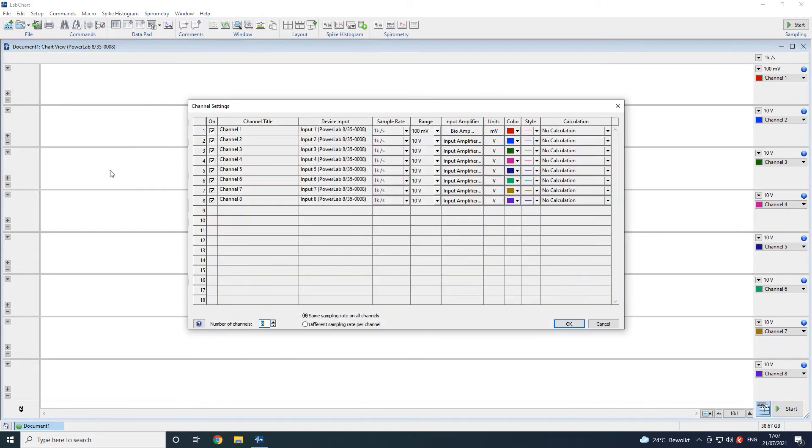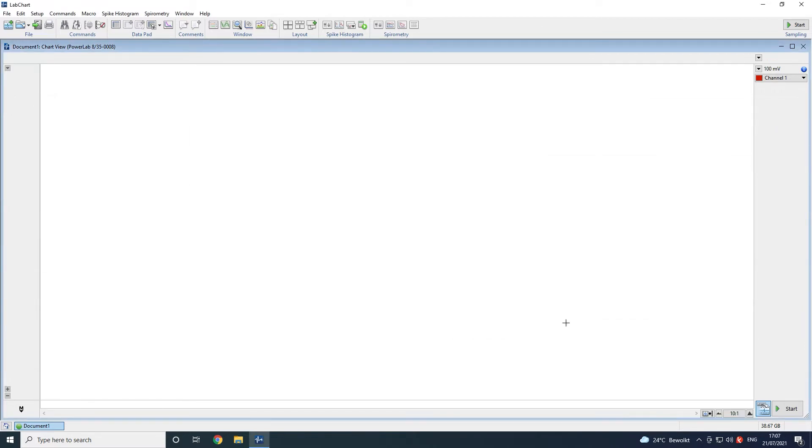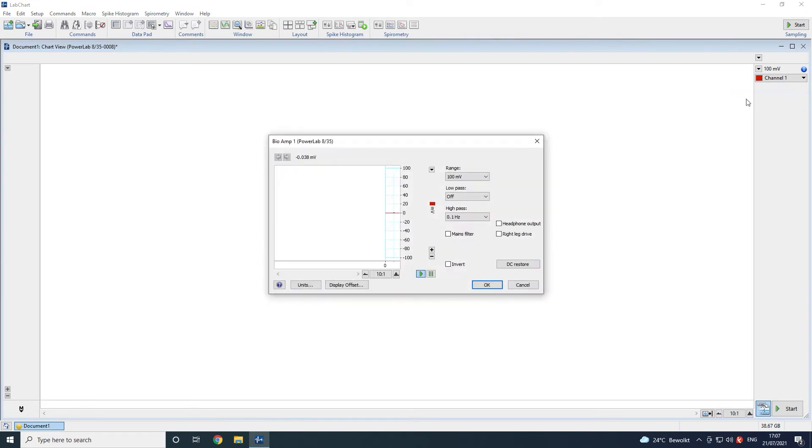With the subject connected to the lead wires, set the number of required channels and then click on bioamp in the drop down list of the channel it's connected to.